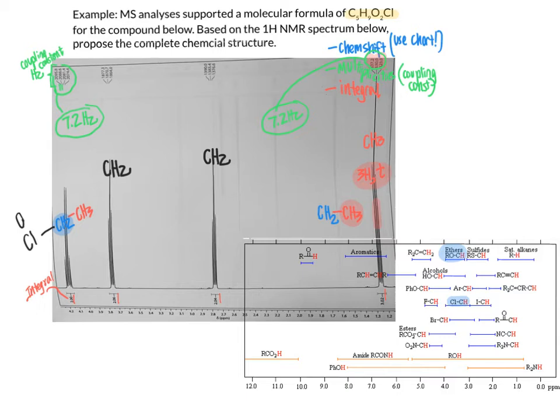But so far it's looking like there's not overall symmetry in the molecule, because we have a CH2, CH3 group here, and we don't seem to have that duplicated anywhere. So I'm going to label these as 2 different CH2 groups, and we're going to ask where could those fit into the puzzle. The CH2 that is further downfield right here is a triplet.